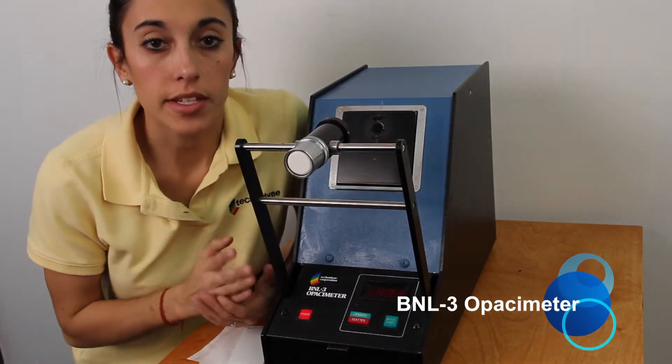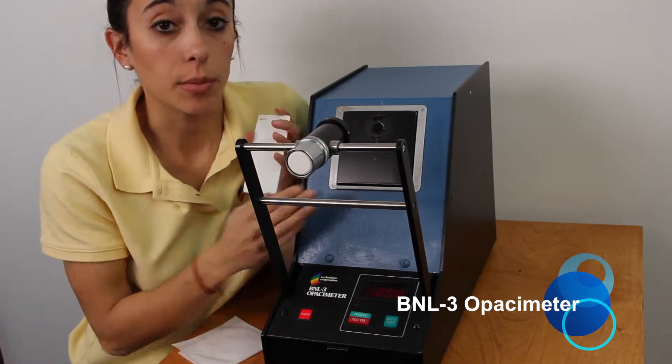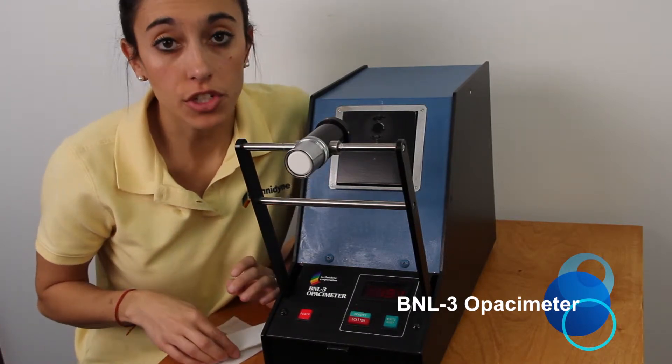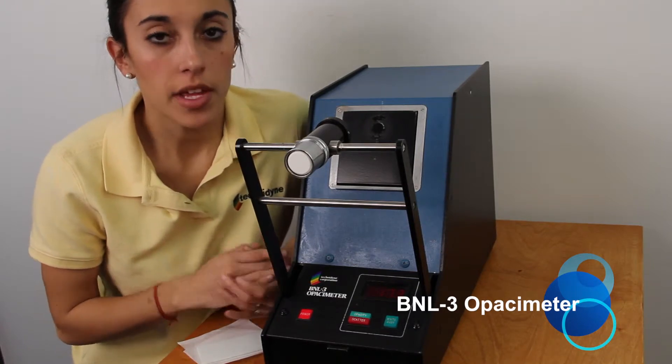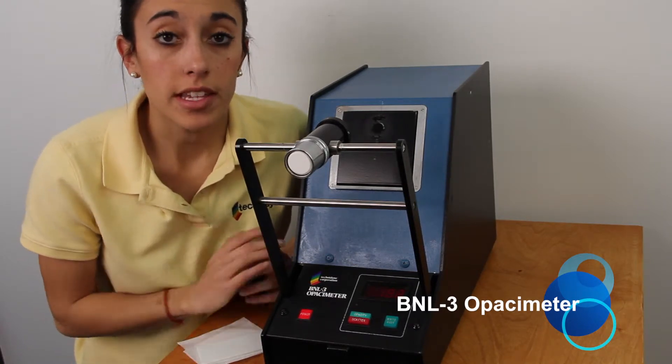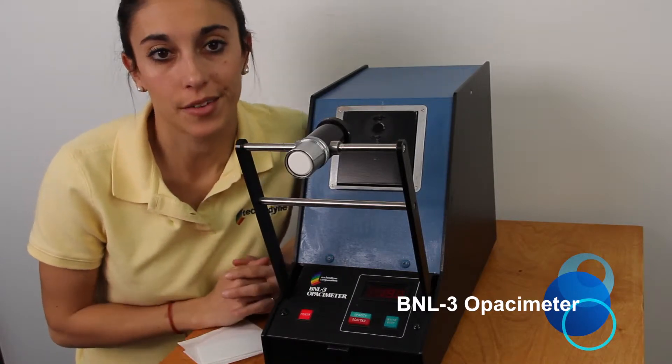Before we can move on to our first step, it's important to make sure that the glass standard and the face of the cube are both clean. If they're not, you can use that cleaning solution and the cleaning wipe to remove all the debris. An important thing to remember is that while you're handling your glass standard, you never want to handle it in the middle — you always want to handle it around the edges.